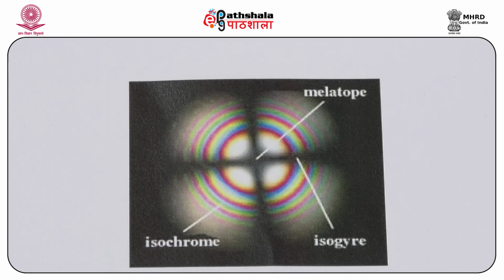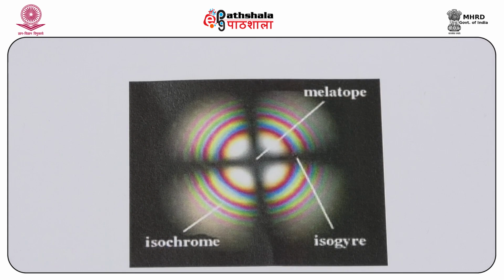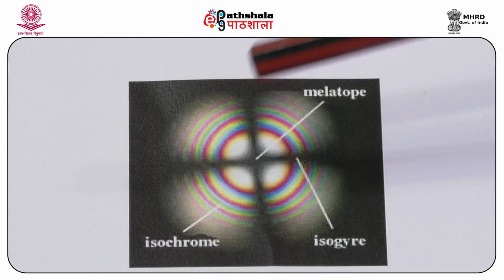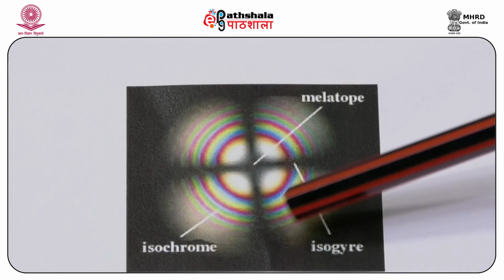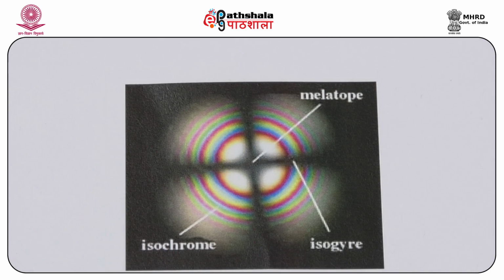A grain with a vertical optic axis should display the lowest interference color of all grains in the sample, and this is how you choose the grain to orient for the optic axis interference figure. The interference figure consists of isogyres forming a dark cross, on which are superimposed colored rings, which are called isochromes.